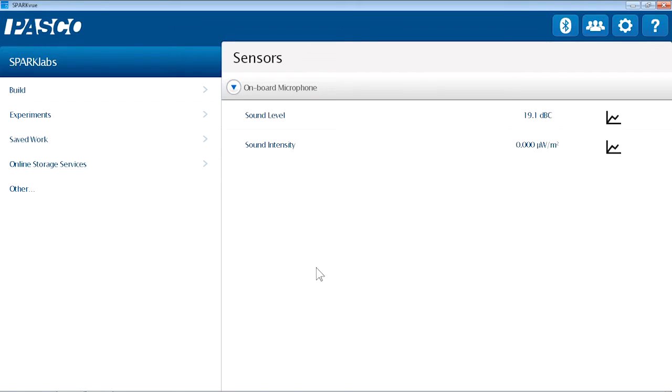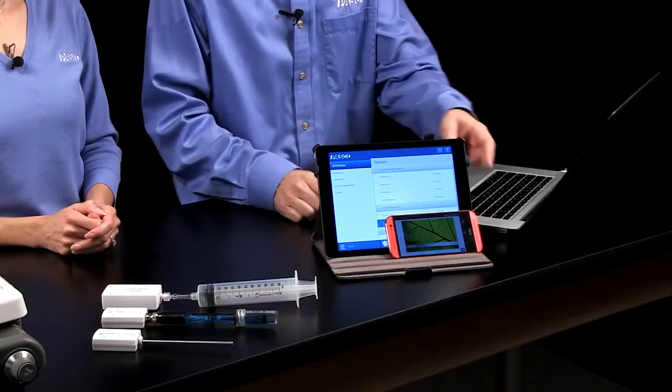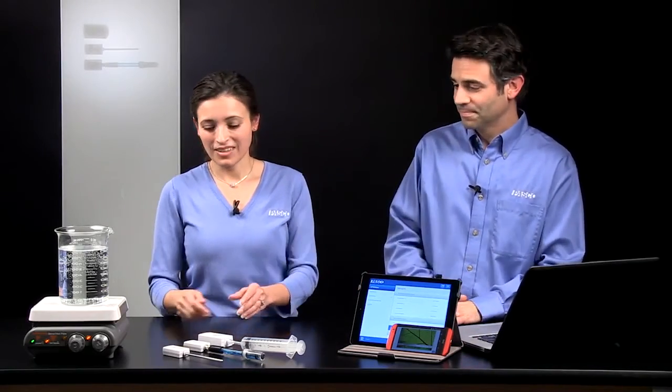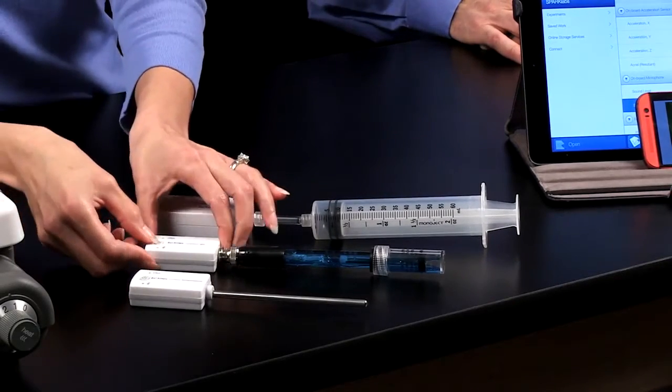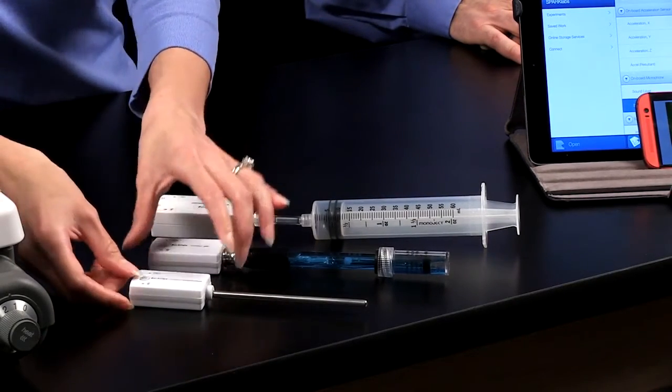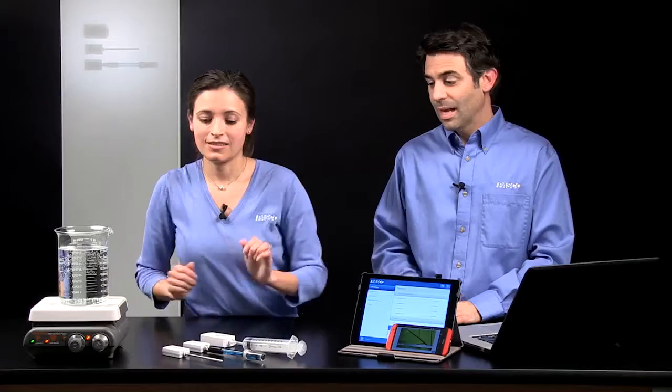And they'll connect to our SparkView software, which is great because it's on all your devices. It's on Macs, PCs, Chromebooks, tablets, and even phones. So to connect, the first thing we need to do is turn them on. So I'm just going to hold the power button down for a second until the red Bluetooth light turns on. And that red light means that it's broadcasting a Bluetooth signal.